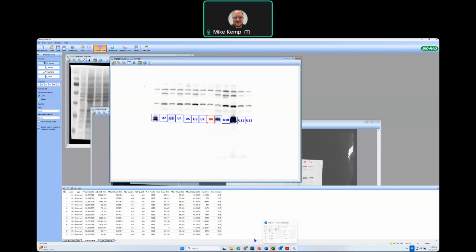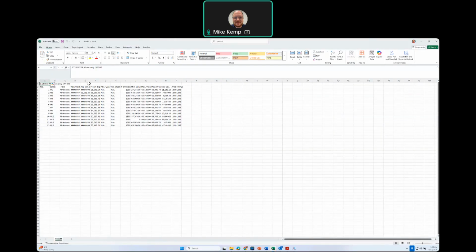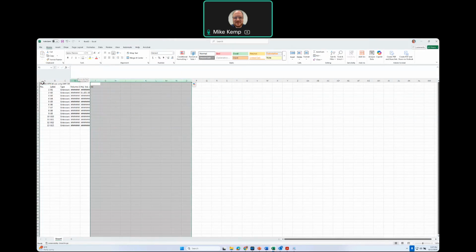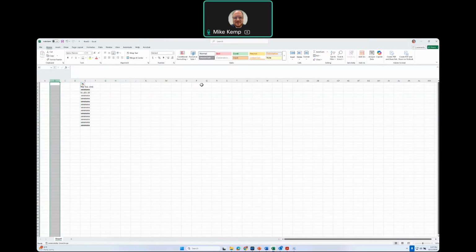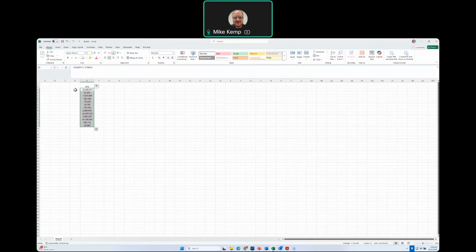It should load up here. File upload or open here. And there's a lot of other numbers we don't need. The only thing we need is this adjusted volume. That's the intensity of the band we're interested in. So I'm going to just select the other columns we don't need and delete them. Like that, everything's centered. This is going to be the XPA band we're looking at. Get rid of some of the extra digits here, and then we'll label it.